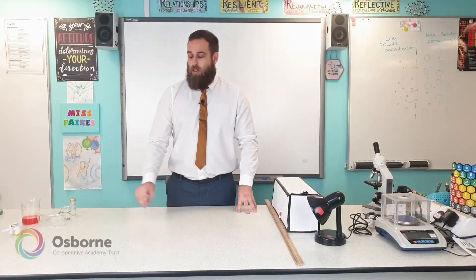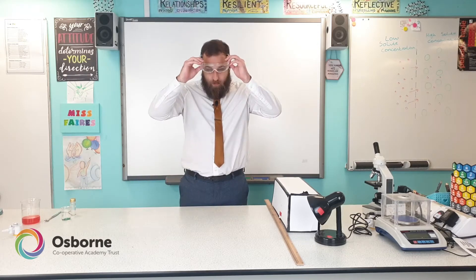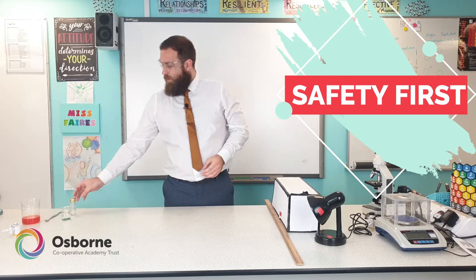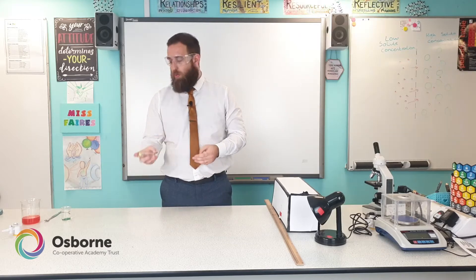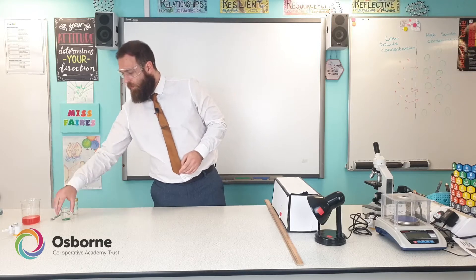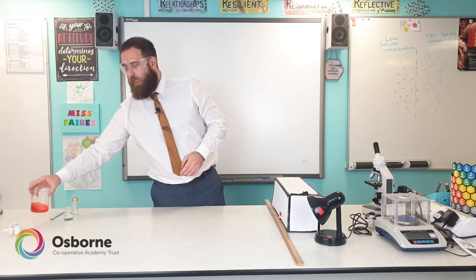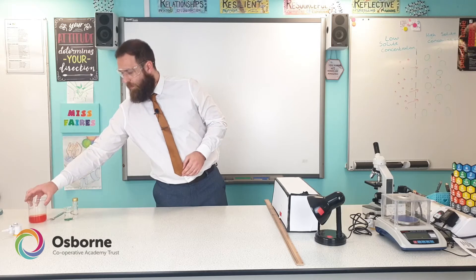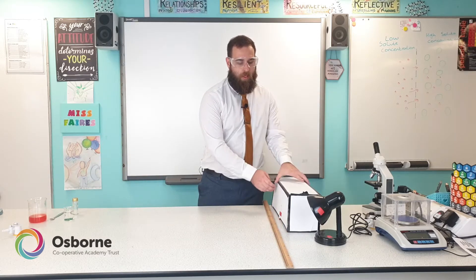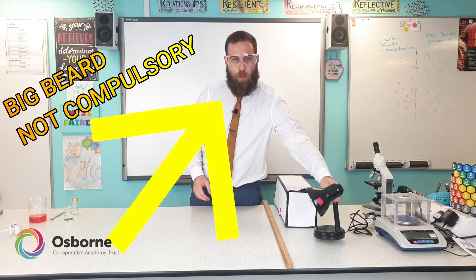Because we're using solutions we are going to need eye protection, so I'm going to place these on now. We'll also need a Bijou bottle, spatula, algal balls, indicator solution, a meter ruler, a cardboard light box, and a lamp.